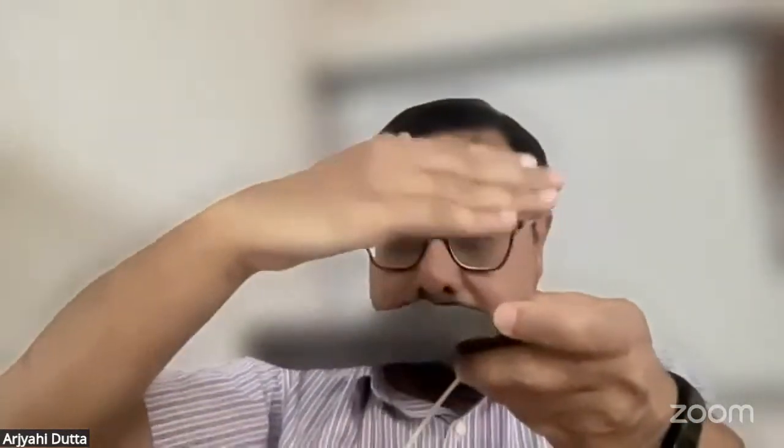Now just consider that this is my carbon, and this is the DNA, right? The DNA is spread here, and the entire platinum system will start rotating, so the evaporation will be uniform and it will spread. Then on one side of the DNA, metal will constantly deposit. When metal deposits on one side of the DNA, it will be thick metal, and you can see it on top of the DNA.